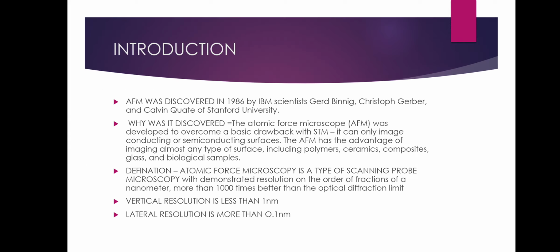Now we are going to discuss the theory of AFM, and while doing so we will discuss its composition, principle and working. AFM was discovered by three scientists: Gerd Binnig and Christoph Gerber of IBM, and Calvin Quate of Stanford University.